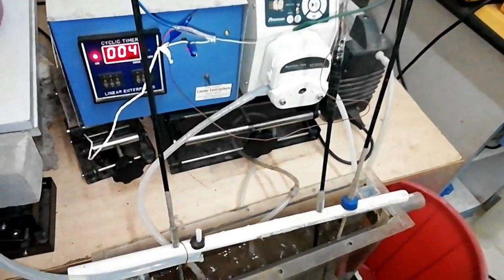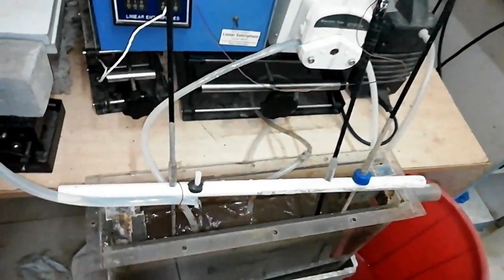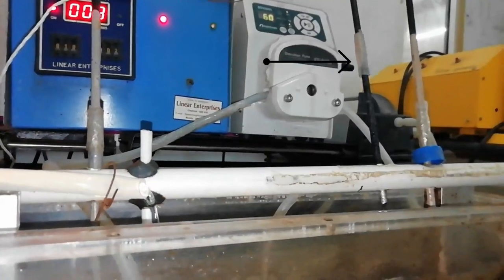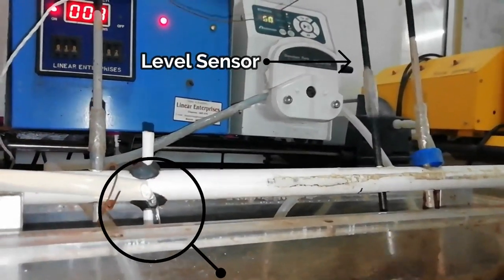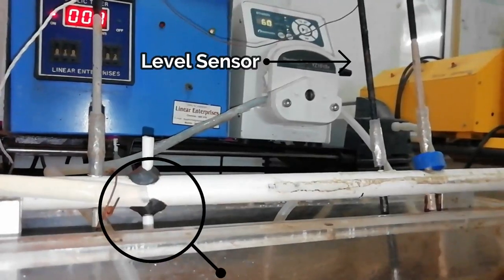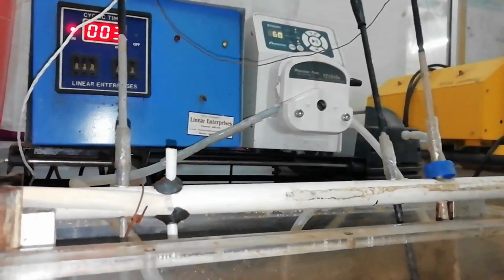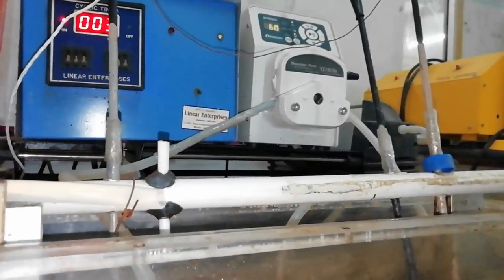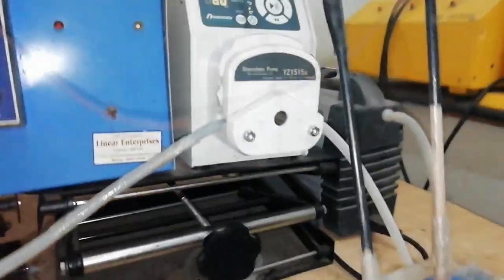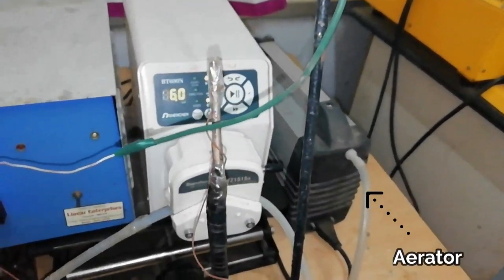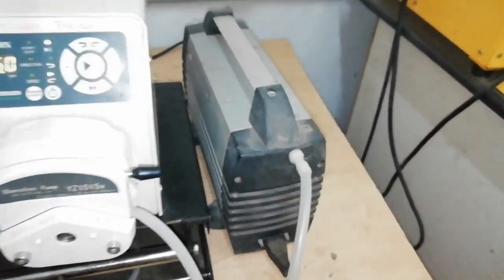So this is an aerobic MBR. You can see the MLSS and level sensor. When we lift the level sensor, the wastewater flows into the system and the aeration is given by an aerator.